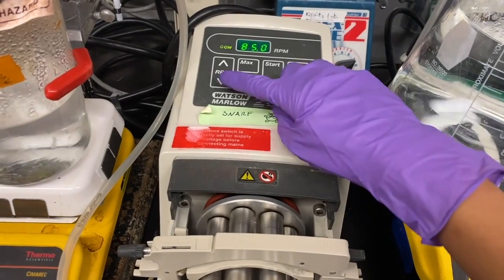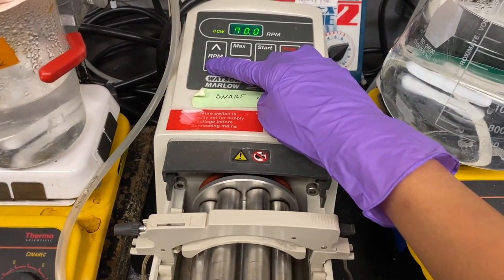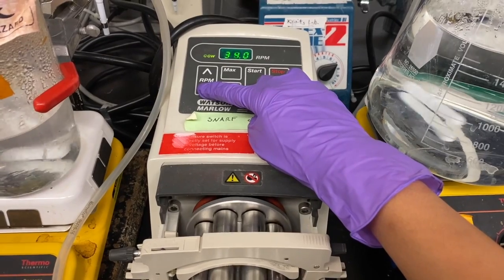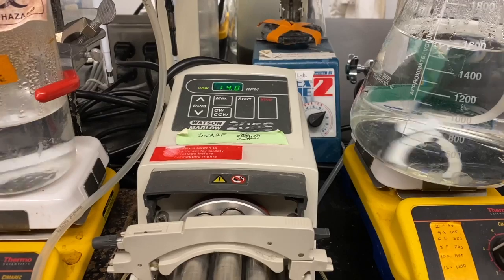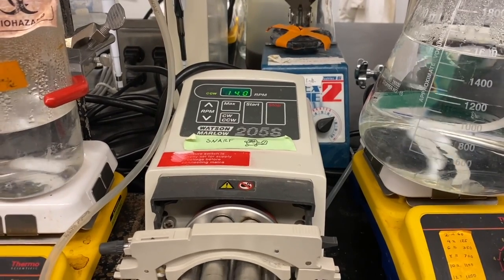After the 24 hours of running in batch mode, flow is initialized. The outlet clamp is removed and waste products can now move into the waste chamber. The speed of the peristaltic pump can be controlled to control the flow rate of the chemostat.